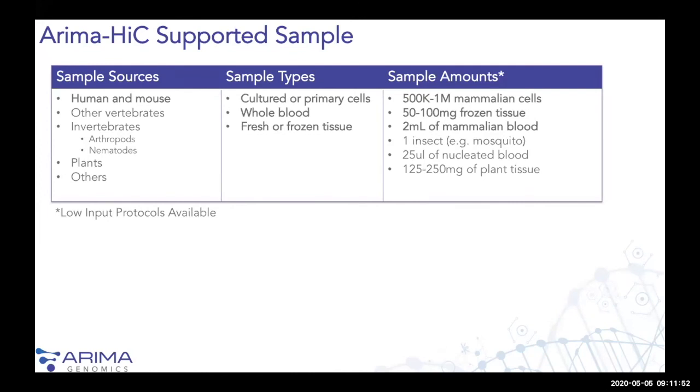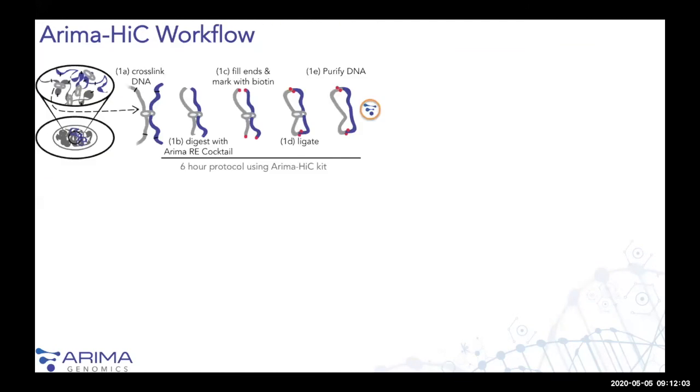And I should also point out that we do have low input protocols available, and I don't have time to go through our low input Hi-C internal data today, but I will point you to one paper that's used our low input Hi-C.